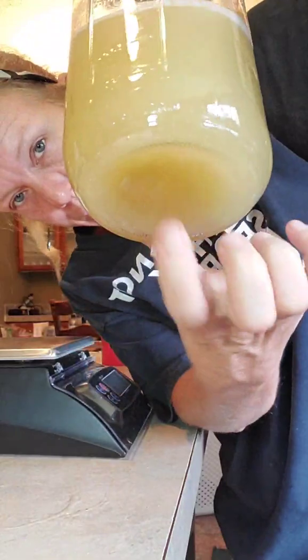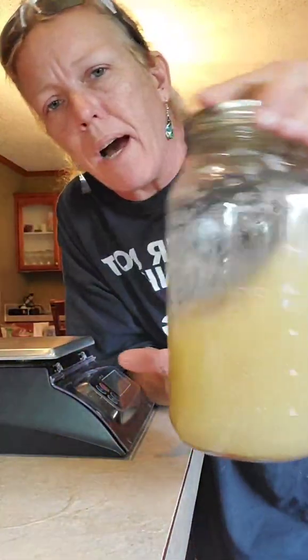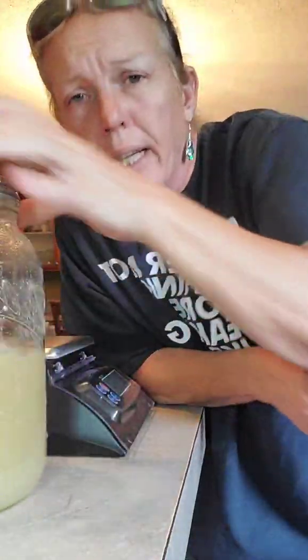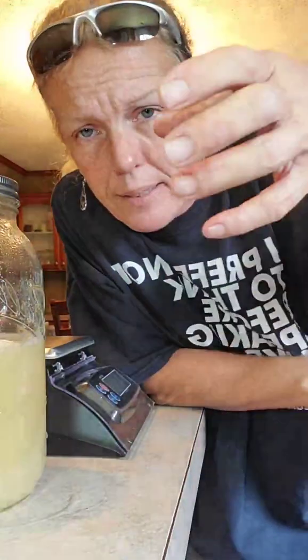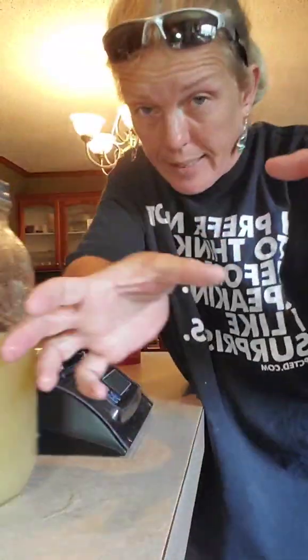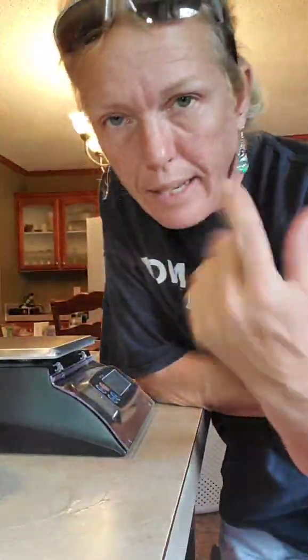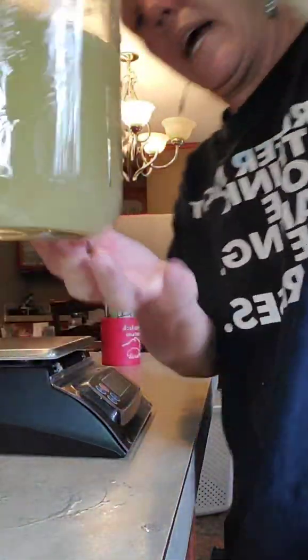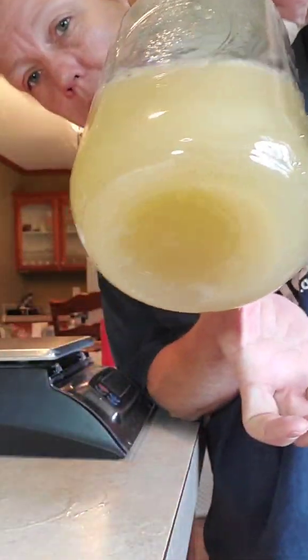And that's why when I showed you guys in that tech video about pouring, when I'm pouring my plates, I've got a stack in this hand. I'm lifting, I'm swirling, I'm pouring, putting down, swirling, pouring. It's in constant movement so that yeast is distributed through each plate. So, we're good now. This is all mixed, and that's as long as it took, all of that powder and stuff.